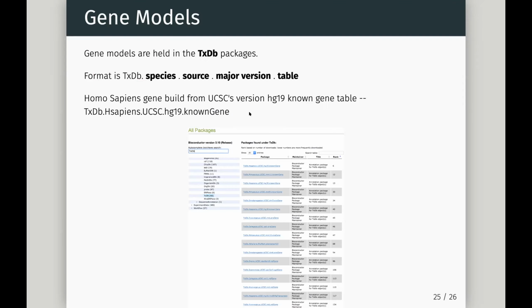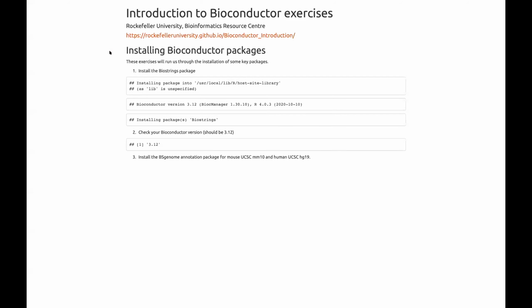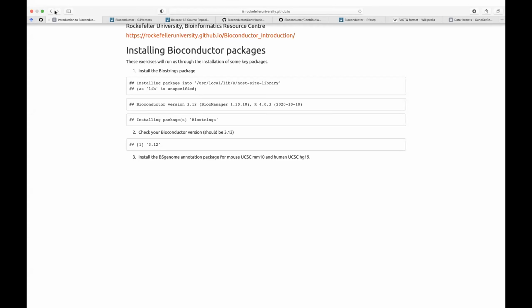Oh, wow. So we've got time for an exercise, but I think I'm going to skip the exercise because it's fairly straightforward, and we'll pick this up at the end, for when we start to go through the sequences. Okay, so I'm just going to ask you to install a package at this point anyway.